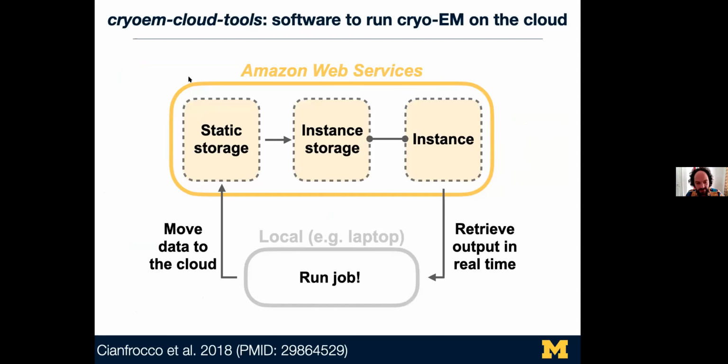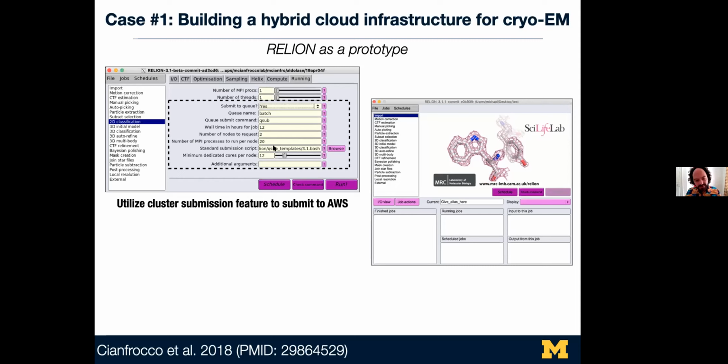The way we did this was easy to do in Relion because, if people have used it, there's this queue submission in Relion. So you could go to the queue, and instead of calling some cluster command, we could change this and make it call our own command.